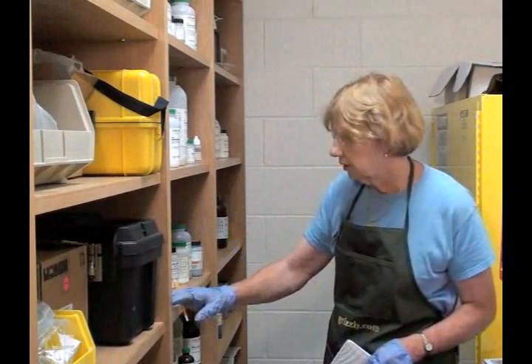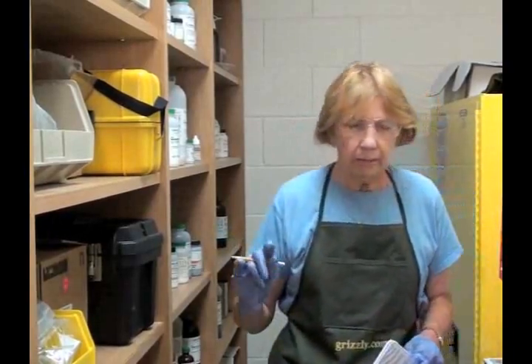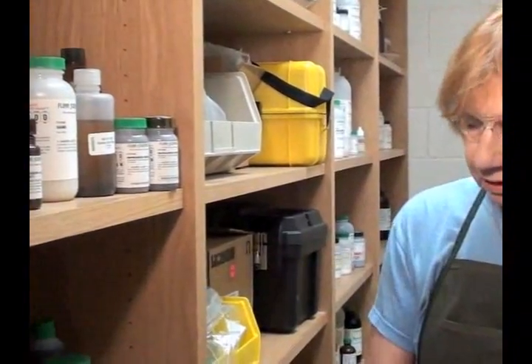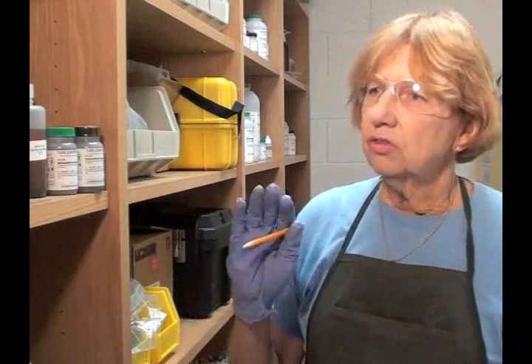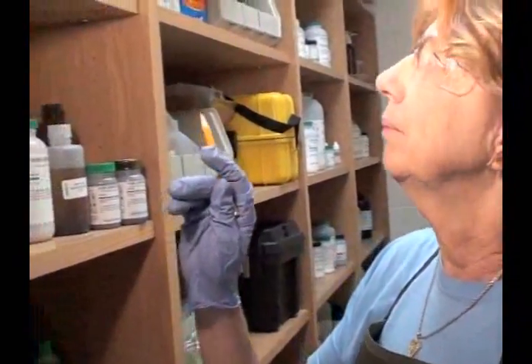I see he also has some potassium nitrate on that shelf, and that's not a good thing. All right, I'm going to get started on this inventory. I'm using an inventory sheet that you can also get on the DEP website. It is in alphabetical order. It has most chemicals you're ever likely to see in a school storage area, and if there's one that's not on the list, you can just add it on the back page. To do this inventory, you just start very systematically and do them one at a time.